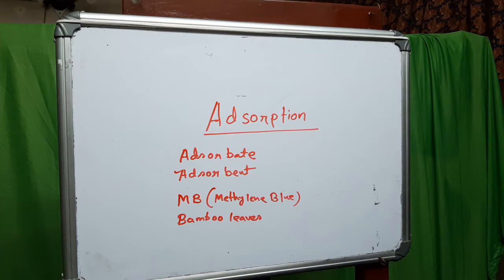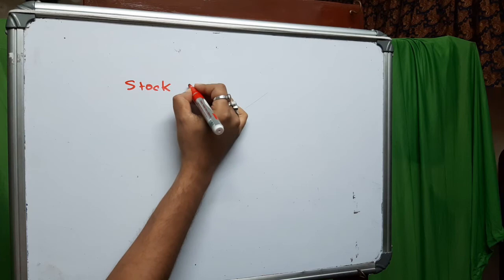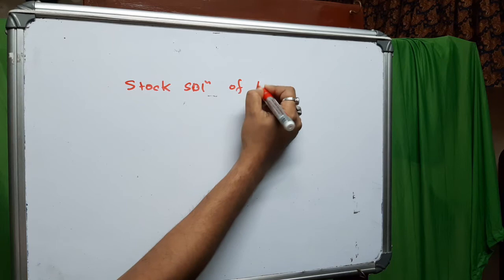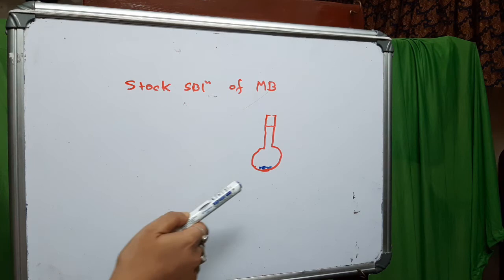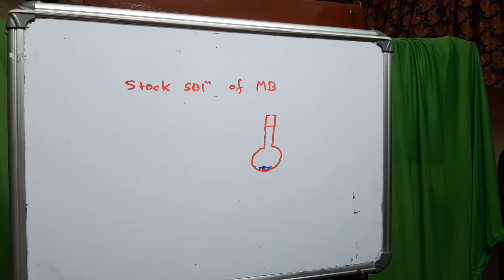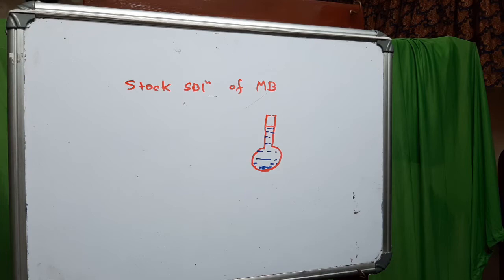The experimental procedure of batch adsorption is the same. Before starting the batch adsorption experiment, we will make a stock solution of adsorbate. At first, take a 1000 ml volumetric flask and add 1000 mg MB. After that, add double distilled water until the mixture volume reaches 1000 ml, making a 1000 ppm solution.